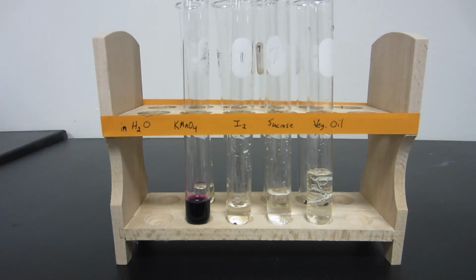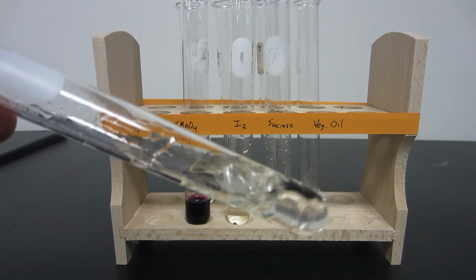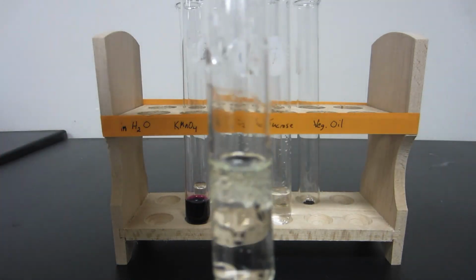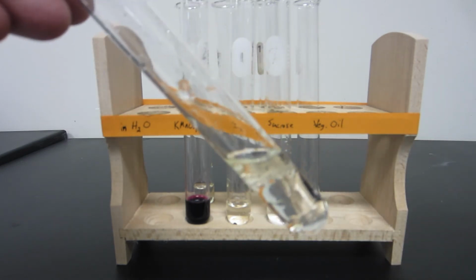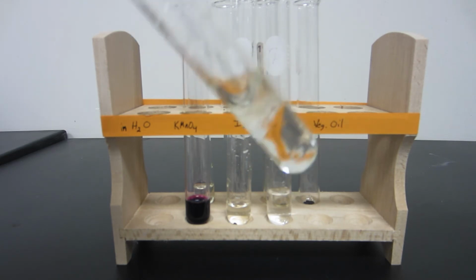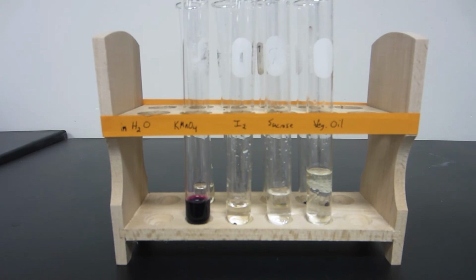And then the last one for this part, I think you can see there is an emulsion forming. There are two layers, and the emulsion is where the two layers are sort of coming together. If I hold it up, you can see that it's the water layer that's on the bottom. Water is more dense than the vegetable oil. So again, that suggests that vegetable oil is a nonpolar solute.